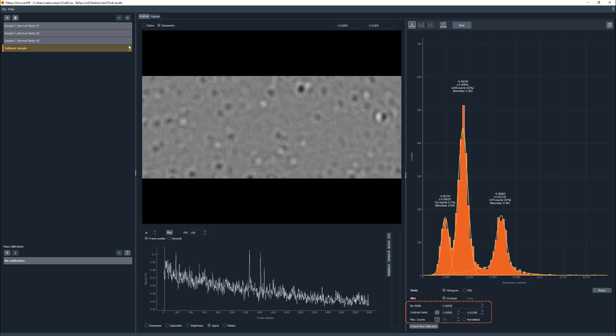You can also change the bin width, contrast limits, and the max counts. It is also possible to switch between histogram mode and kernel density estimation mode. The controls mentioned are the same for both modes available.